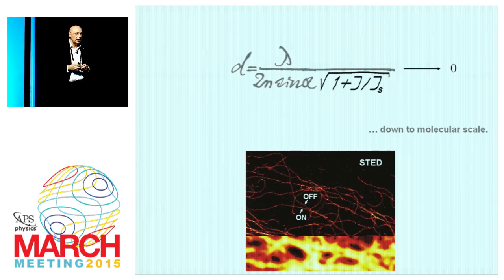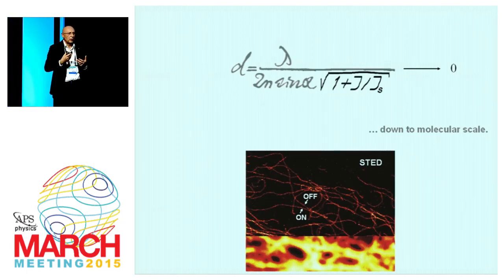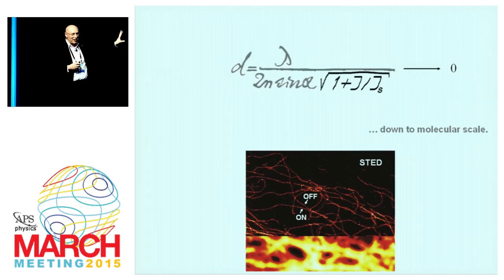If you use just a single lens, right now, if you ask me for STED, it's about 60 nanometers or so. With single molecule on-off type of methods, I think it's slightly better. You can get down, to my knowledge, to about 30 or 40 nanometers, depending on the fluorophore. So it's very important to realize here that the limitations of the resolution are, of course, given by the molecules, by the states of the fluorophore. It's not so much the way you focus and the lens. So this is really critical.